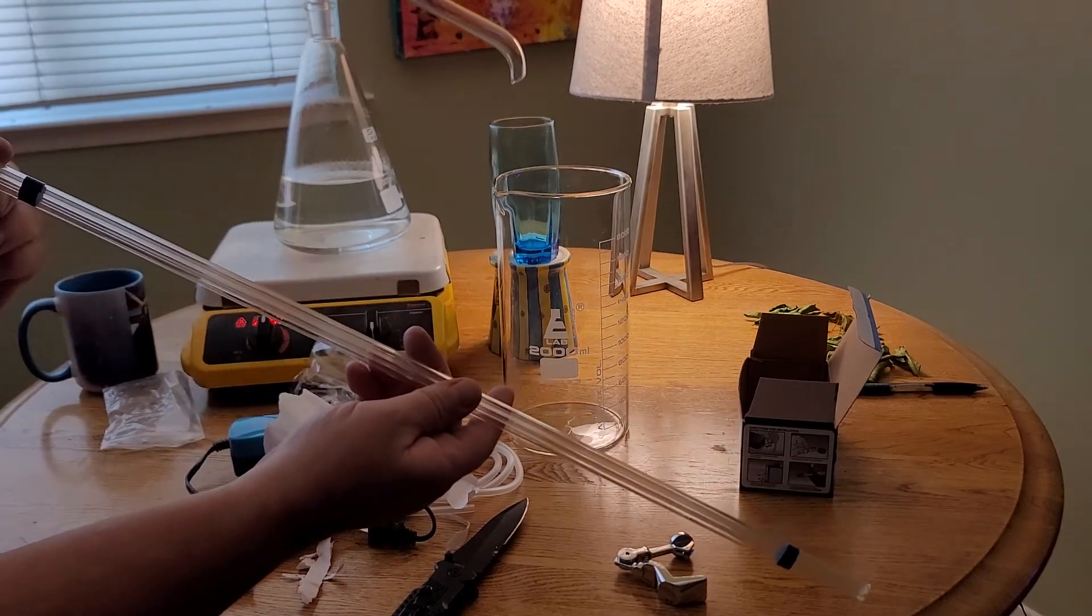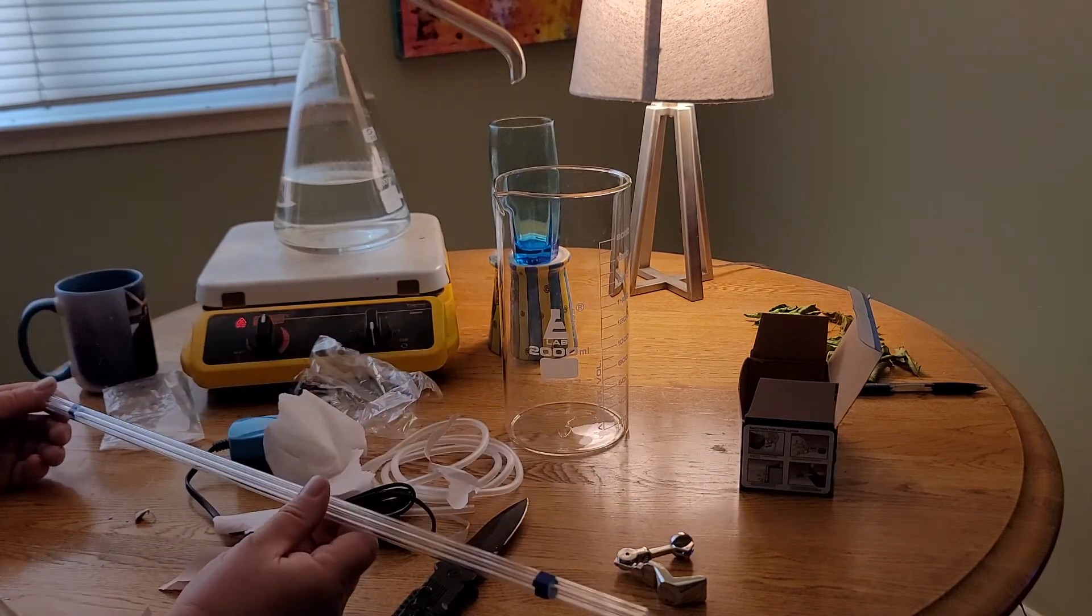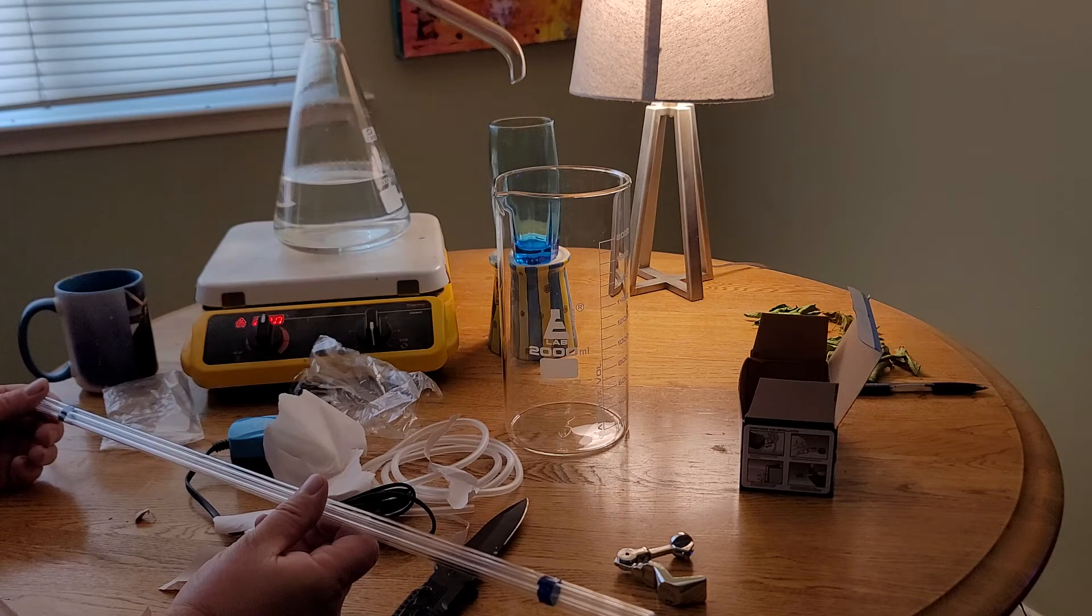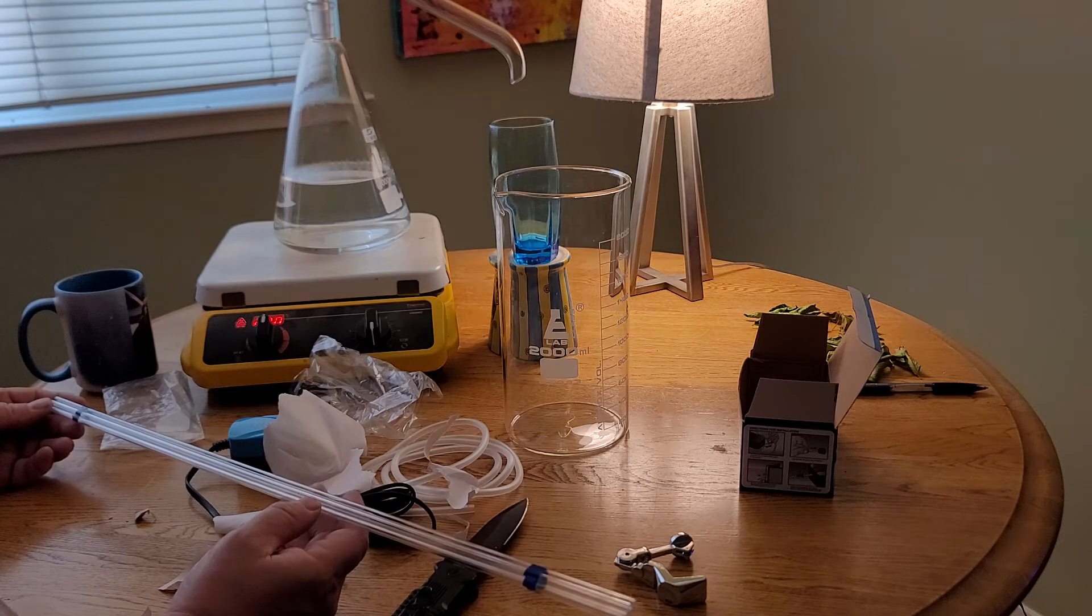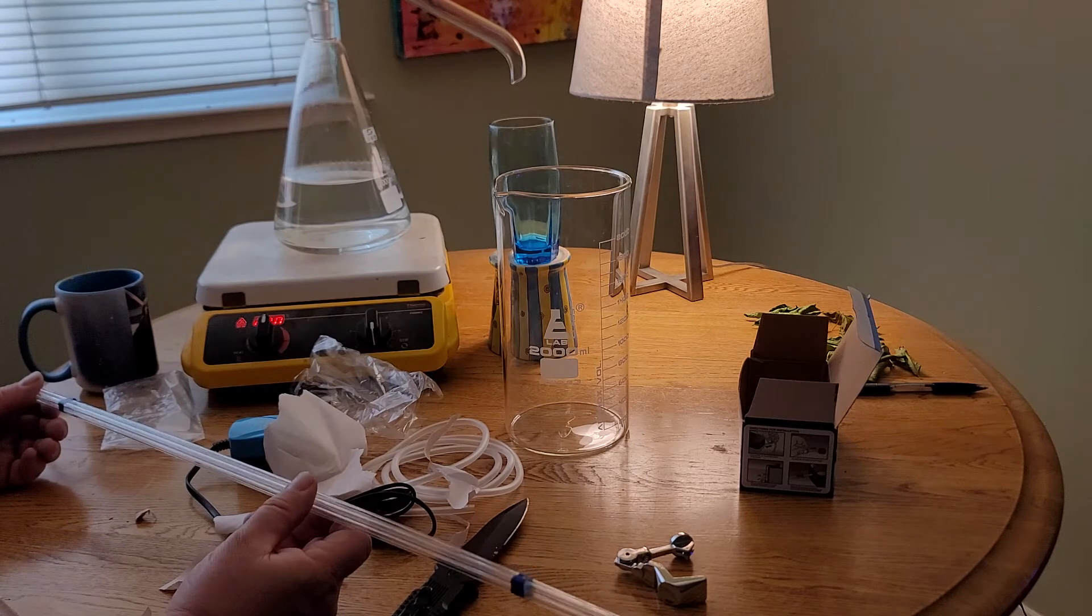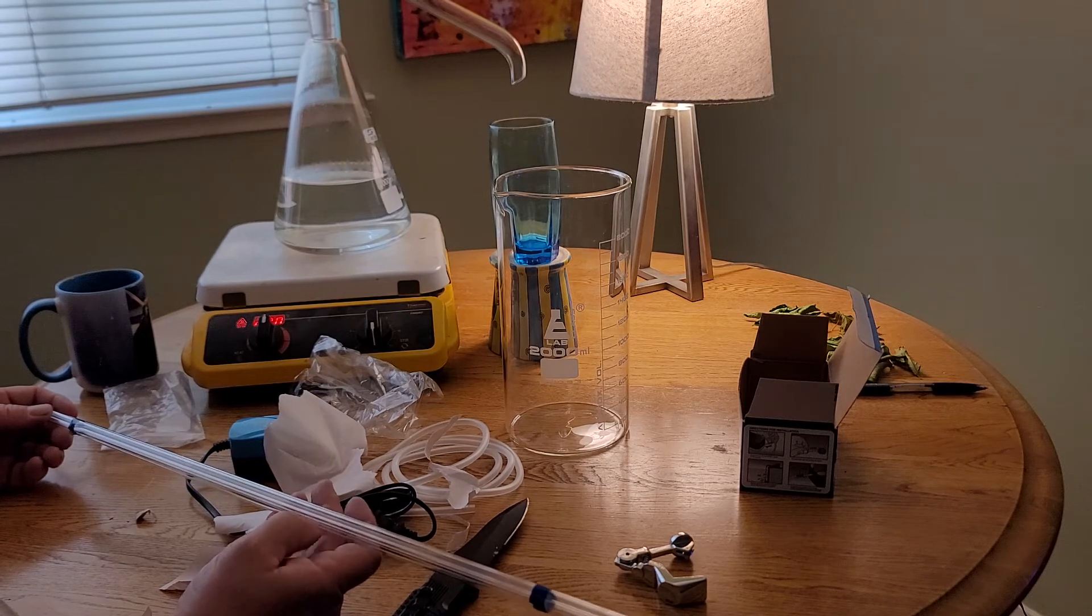So they're taped together. One, two, three, four, five. There's five of them in here. I thought I was supposed to get more than that. I'm going to have to recheck my listing. These are 24 inches long and they are advertised as 5mm glass tubing.